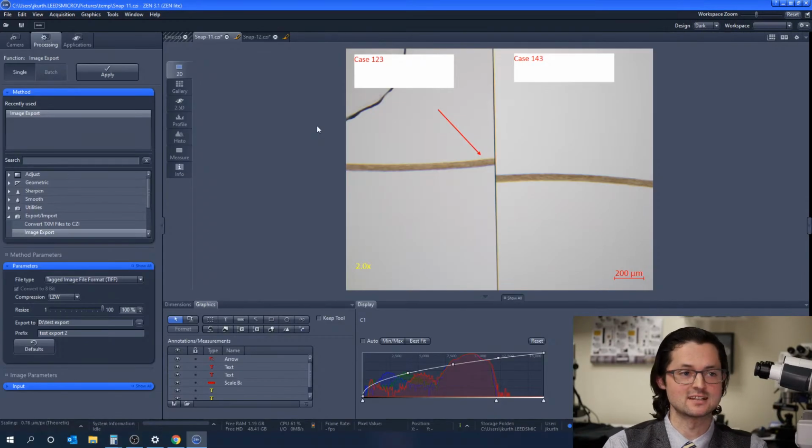That's essentially all I got today. Hopefully this helps you as you're using our products in your casework, trying to get pictures on things, trying to quickly move through, getting annotation information on it, getting the objective, getting the zoom or the Optivar setting from a Discovery or Discovery Z on your picture. So then you can just look at it and say, hey, I was at 43x.